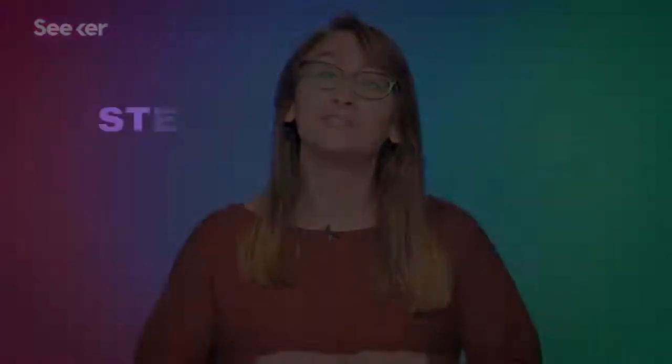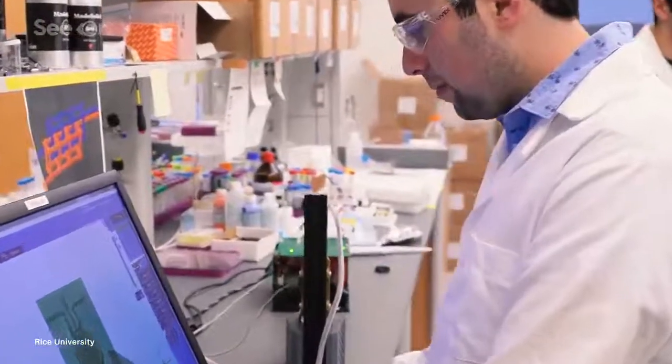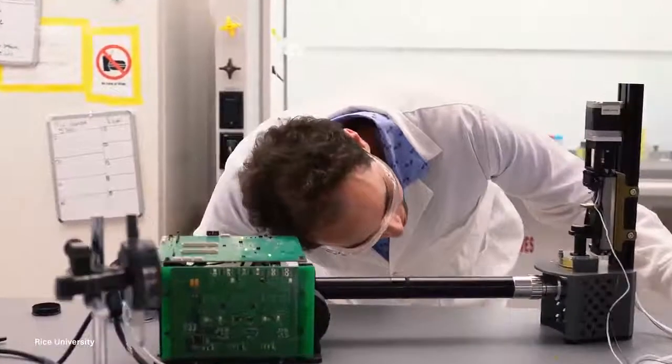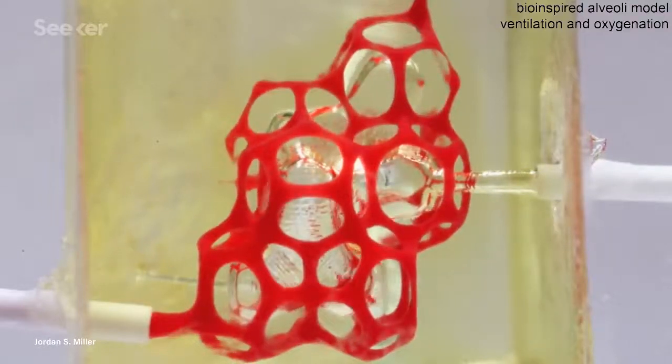They used a technique called stereolithography apparatus for tissue engineering, or SLATE. It's an open source bioprinting technology that uses additive manufacturing to create soft hydrogels layer by layer by using light from a digital projector. So this is a light-based polymerization system. We have a light-sensitive liquid that when you shine the right color of light at the right intensity of energy, the right number of photons hit that sample, you can convert that liquid into a solid only in that region.